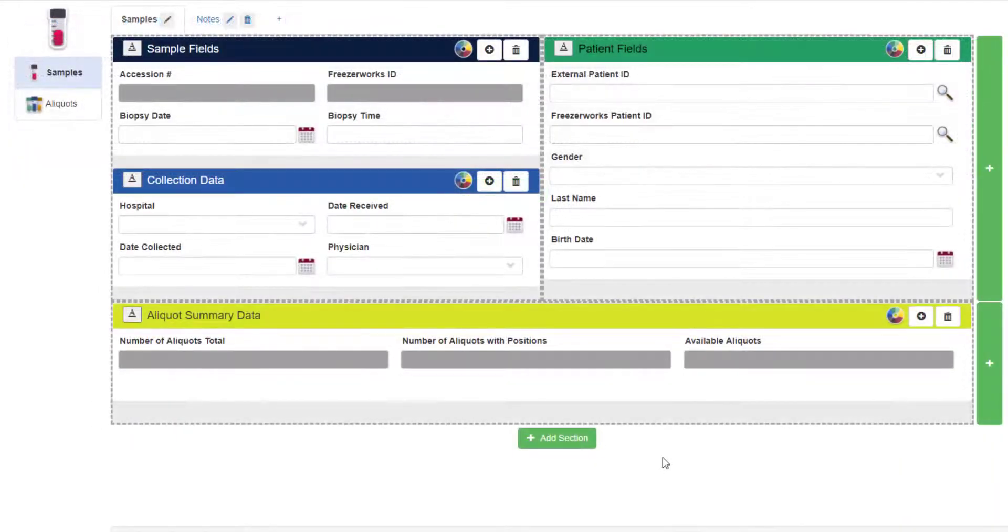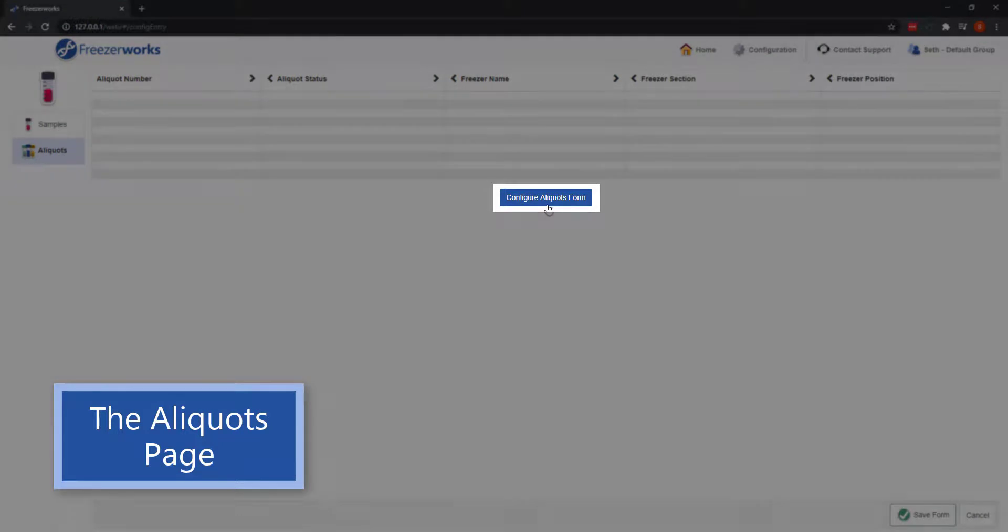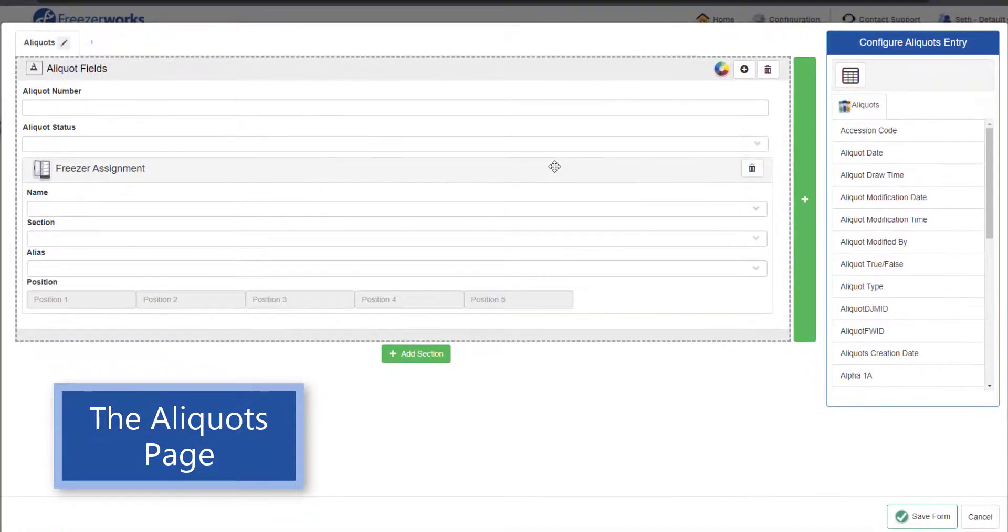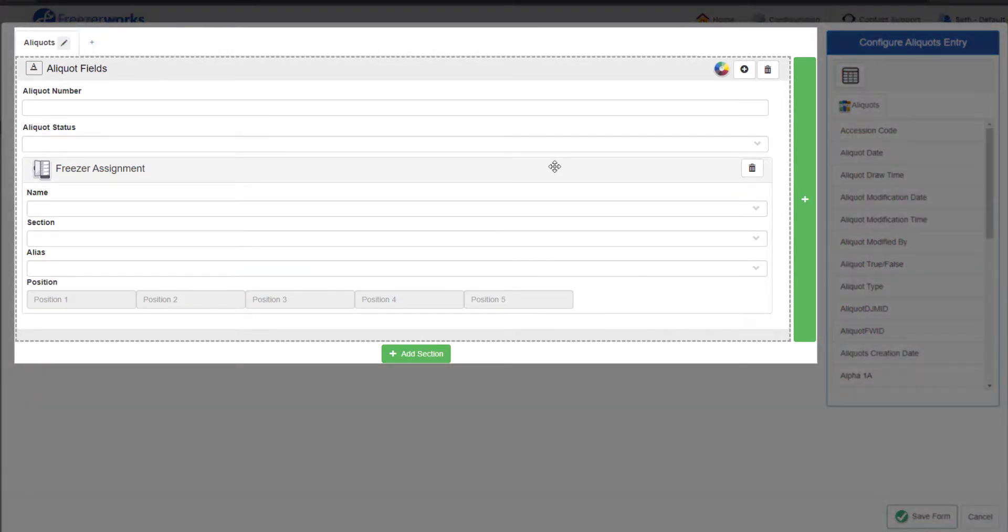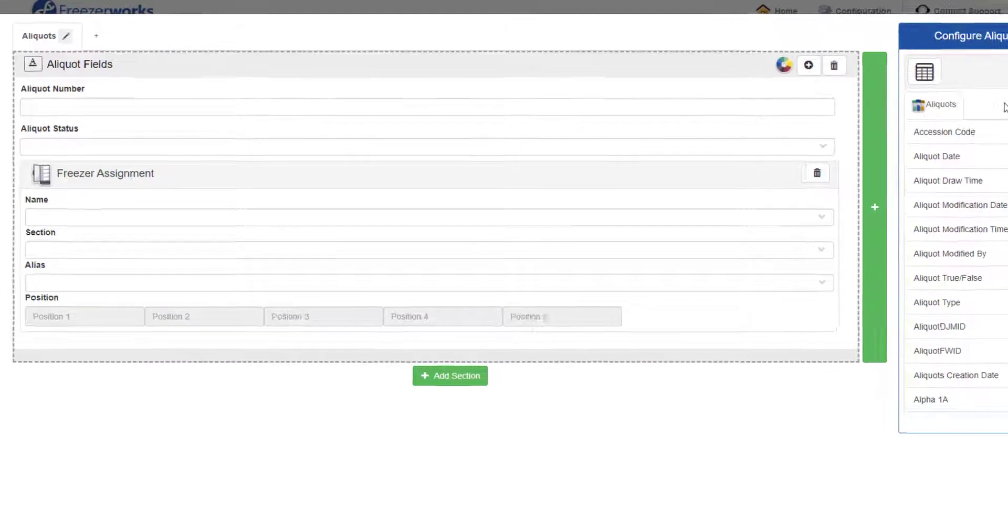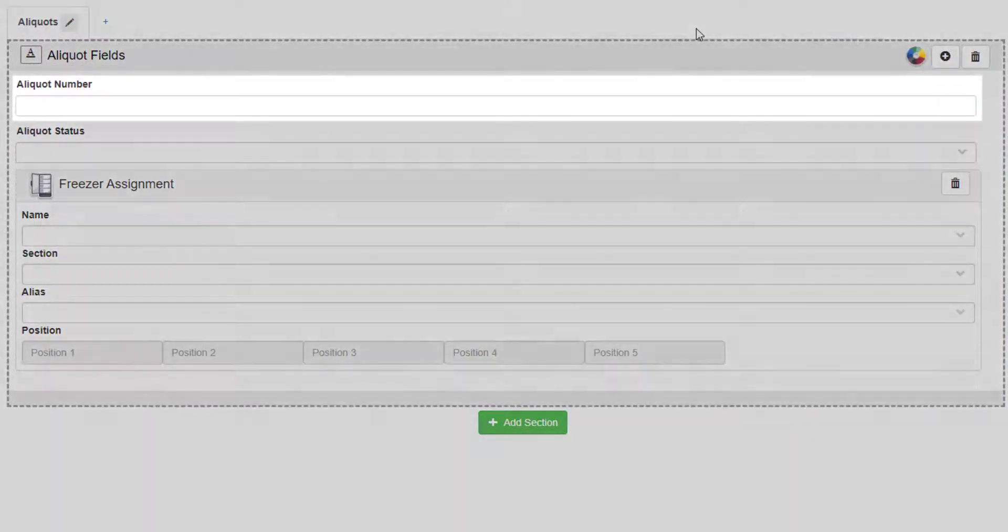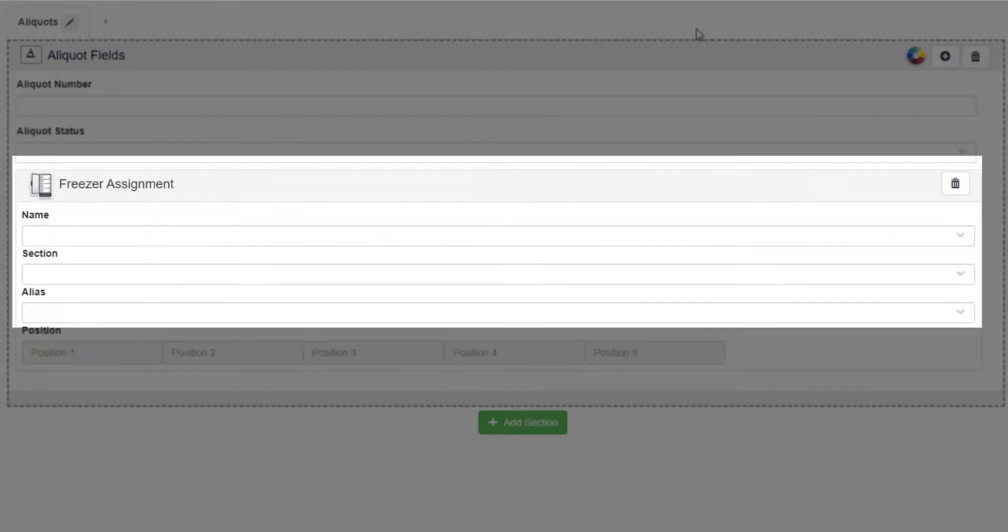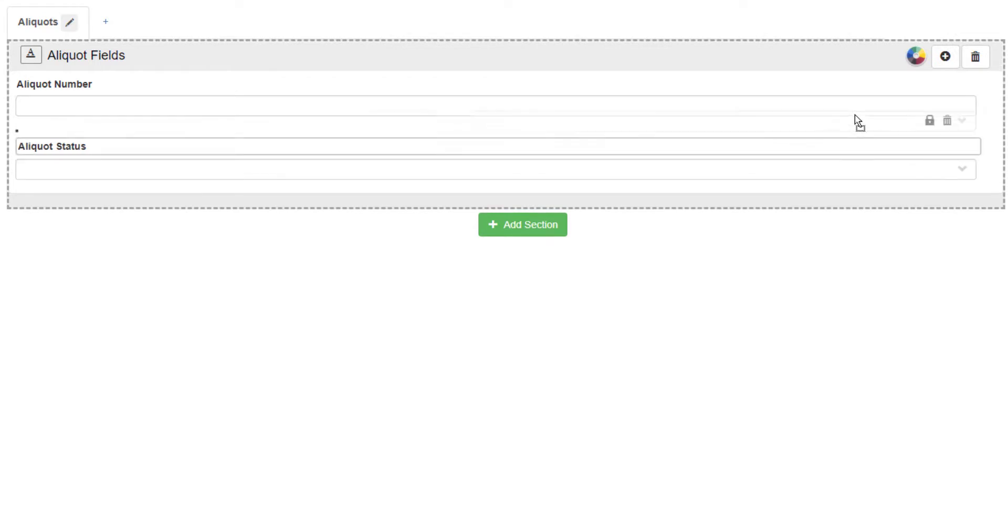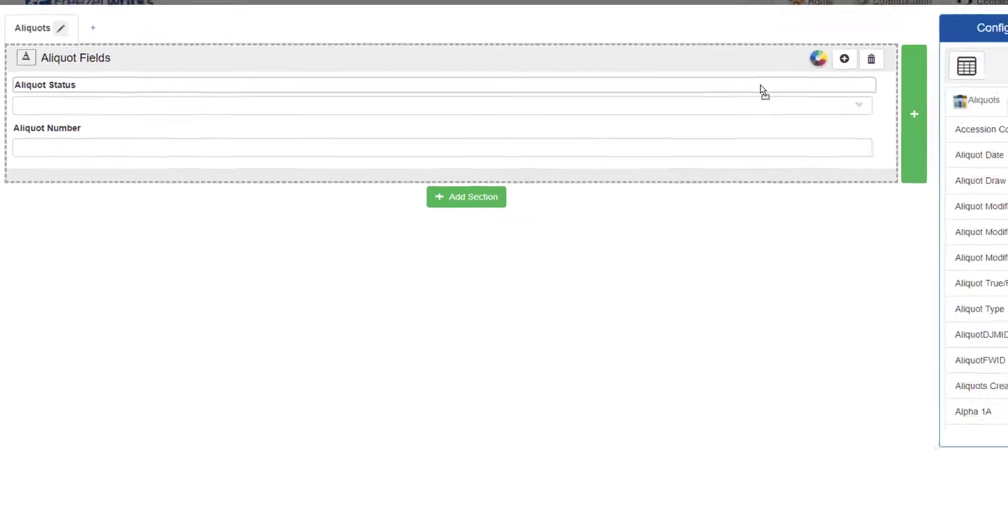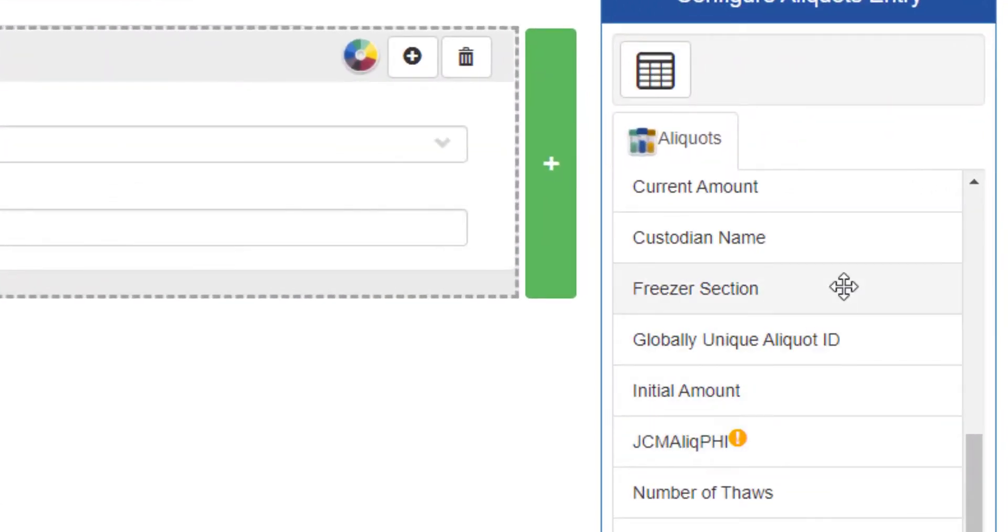When you're done with the samples page, you can move to the aliquots page and begin designing that form by clicking configure aliquots form. Designing the aliquots entry form is almost exactly like the samples form. You have an entry area made up of sections, panels, columns, and colors, and you have your palette with the panel tool and a list of available aliquot fields. The entry area will have three fields already on it by default: aliquot number, aka number of aliquots, aliquot status, and the freezer assignment box. You can remove aliquot status and the freezer assignment box, but aliquot number is required on every aliquots form. Of course, you can move all the fields freely, so put them wherever you please. Note that if you remove the freezer assignment box, you can always put it back on the form by dragging the freezer section field from the palette.